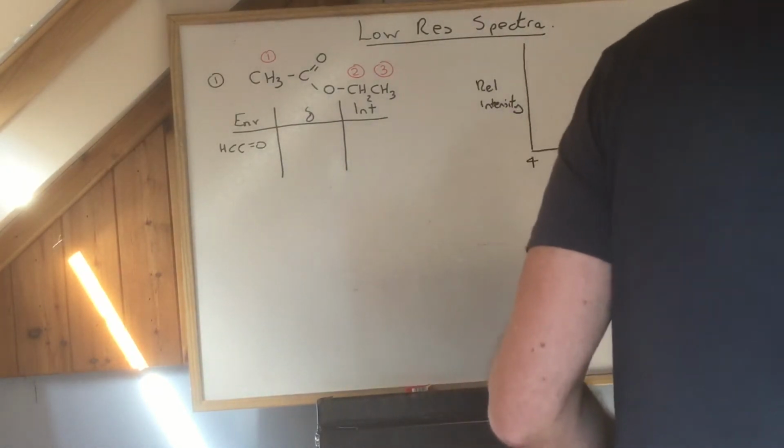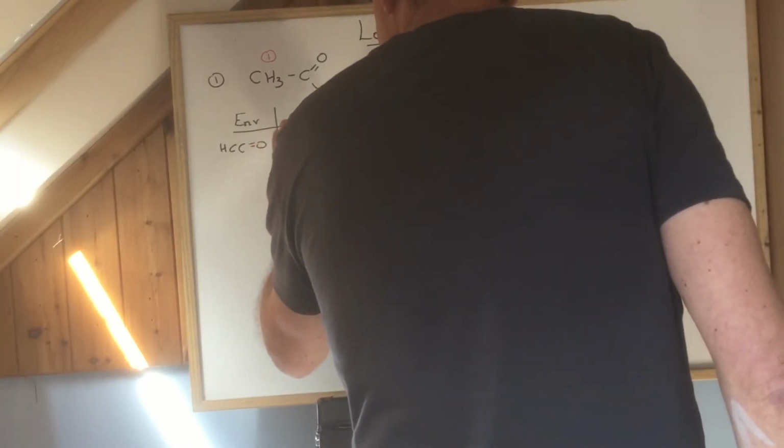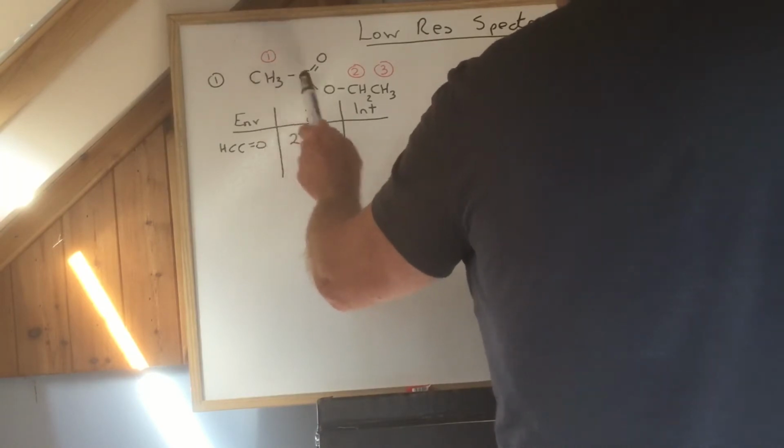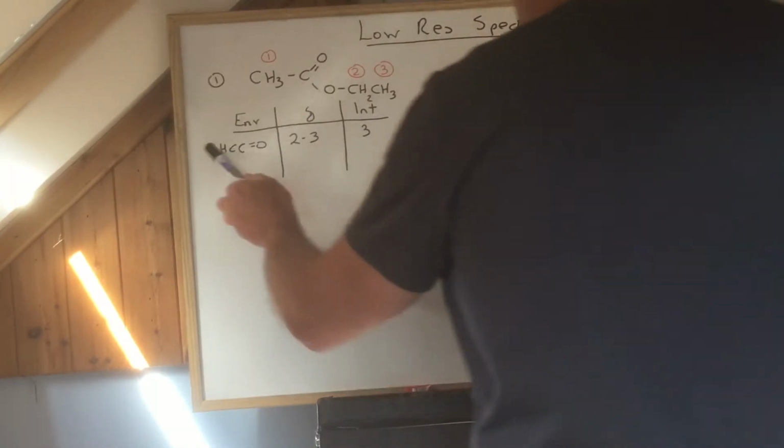Chemical shift 2 to 3. Integration, there's 3 in that environment. H, C, C, 3. Looking at these 2 here, so that's number 1.